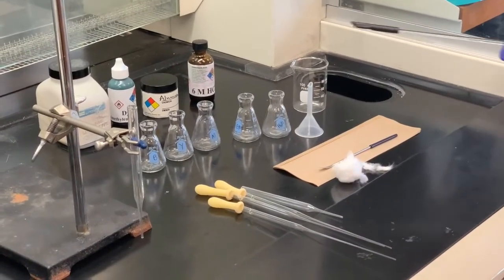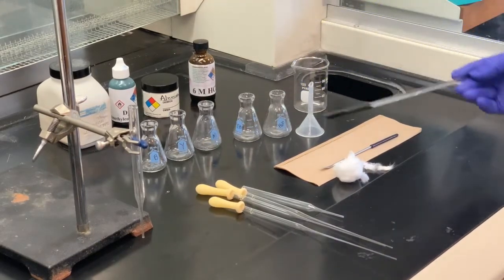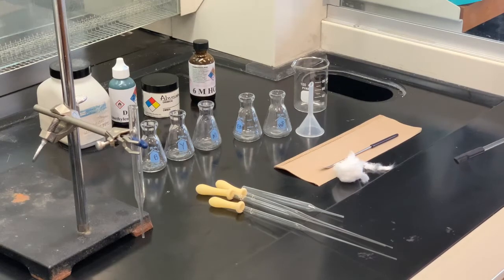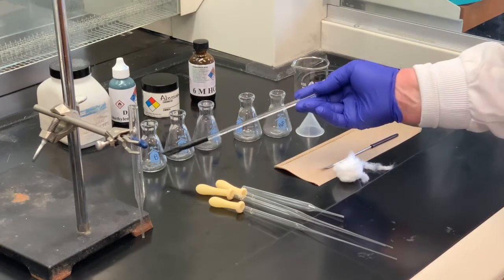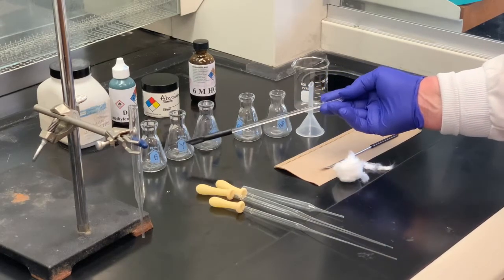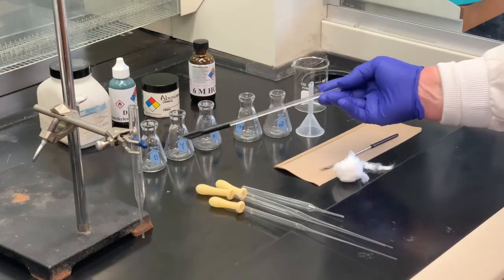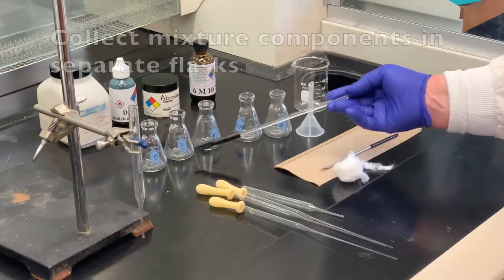And then we'll need several small flasks. I've labeled these. What we're going to separate today is a dye mixture. One is going to have a blue color and I labeled one flask B for blue. The other component is yellow, so I labeled it Y.